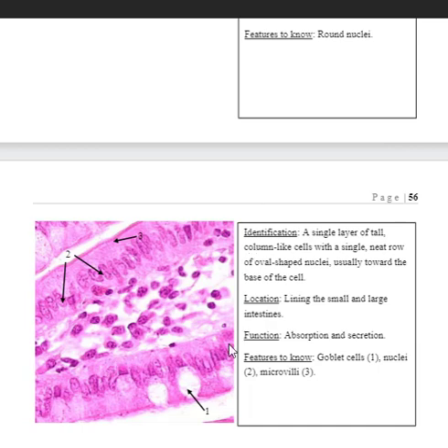This particular picture right here happens to be from the intestines. You can notice here's the nuclei all lined up kind of like soldiers in a row right there. And if you look from here to here, you can see that these are columnar cells. So you can see they're tall, skinny, and their nucleus is kind of squished skinny because they are tall and skinny.